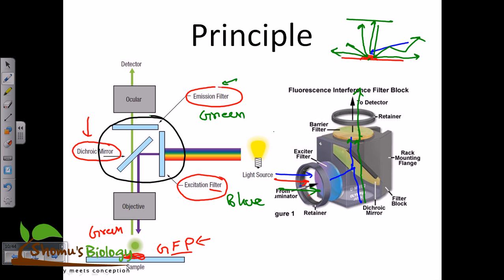Now the interesting fact about fluorescence microscopy is quantification. We can actually measure the amount of fluorescence that is coming in. By measuring the fluorescence, we can tell how many proteins of the type we're dealing with are present, and all these things. We can detect all of these, so that is a very interesting fact.